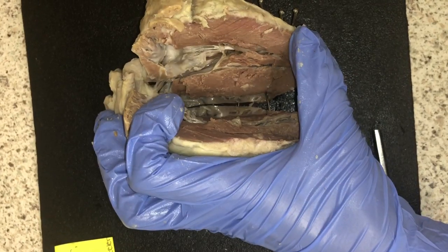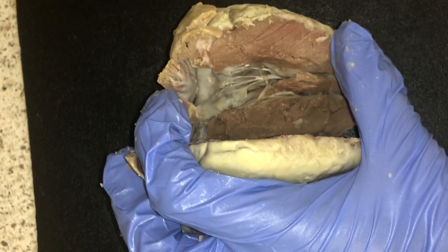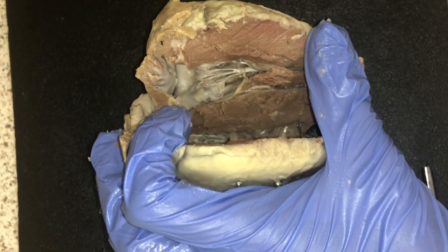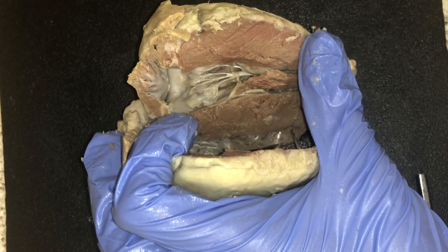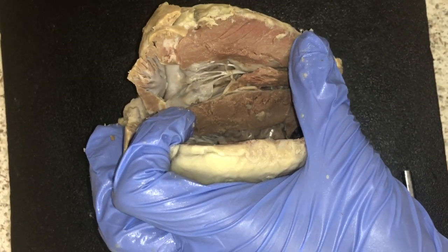The internal anatomy of the right side of the sheep's heart. So we have the right atrium, which is located right there. The right atrium is the right upper chamber of the heart. It receives deoxygenated blood from the body through the vena cava, and it pumps it to the right ventricle, which then sends it to the lungs to be oxygenated.